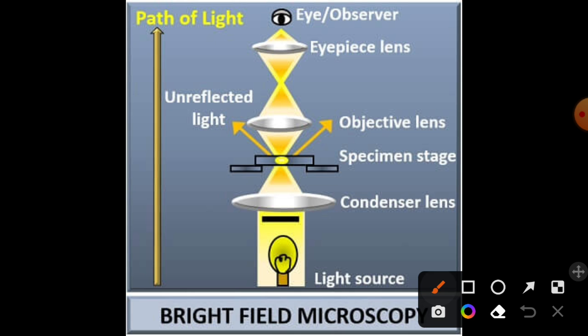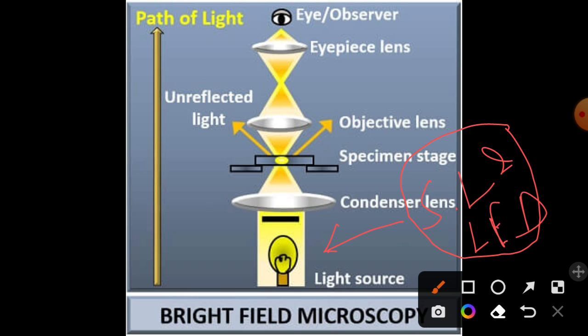So let's start. Here the light source that we are using is generally sunlight or any LED light. If you know about polychromatic light, then I hope you know that the light coming from sunlight or any kind of LED source is polychromatic. So what does the term polychromatic stand for? Polychromatic simply means it is a light source which consists of lights of various wavelengths.